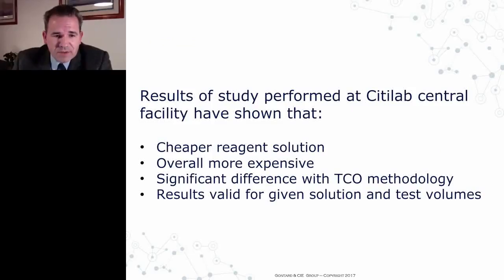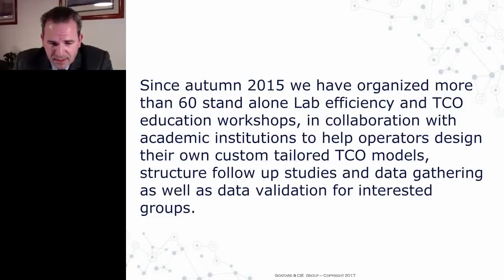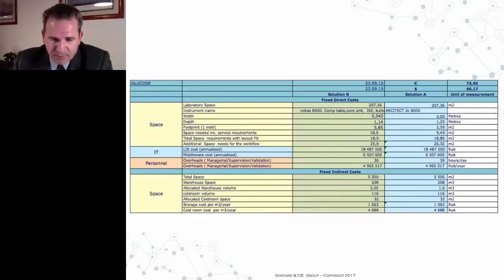Let's go straight into the example of a TCO. So a TCO is basically a mathematical model that is then programmed into a data extraction module to extract the data from the middleware and the LIS, and is summarized into an Excel sheet.